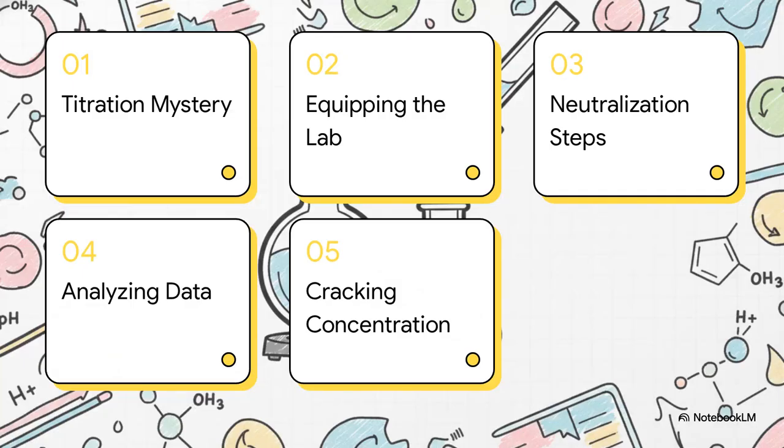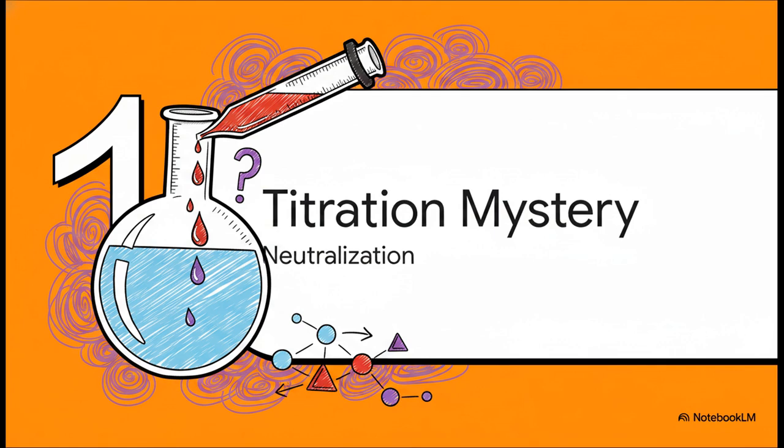answer. Okay, let's quickly map out this investigation. We're going to cover the mystery of titration, equipping the lab, the step-by-step neutralization, analyzing our data, and finally, cracking the concentration. Starting right off with Part 1, the mystery of titration and understanding neutralization.